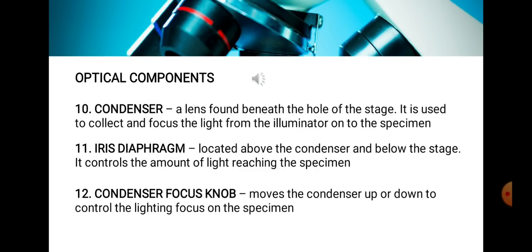If the maximum power of your microscope is 400 times, a stage mounted 0.65 NA or greater condenser is ideal since it gives you greater clarity without having to be focused separately. However, if your microscope goes to 1000 times or above, a focusable condenser lens with an NA of 1.25 or greater is needed.